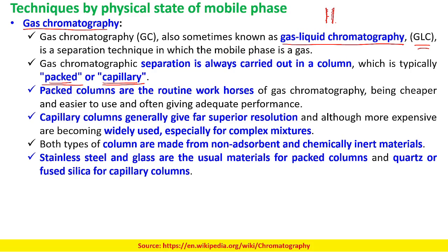However, in packed chromatography, as the name suggests in gas liquid chromatography, we need a liquid, so there would be stationary phases which are particulates or powdered in shape. These particles are coated with a thin layer of the liquid, which helps in the partitioning of the analytes between the gas and the liquid.